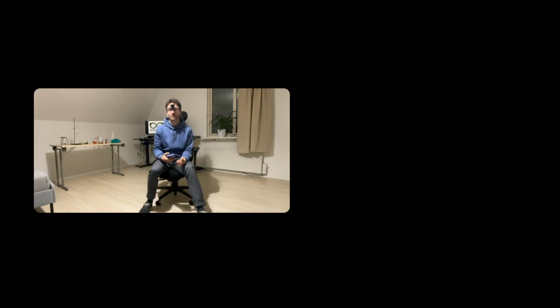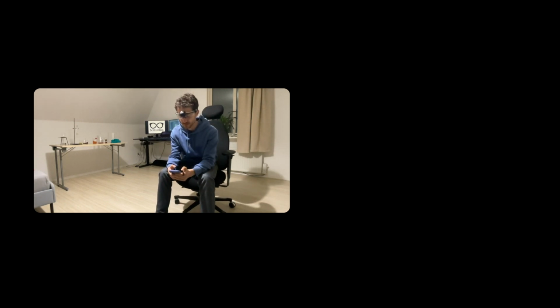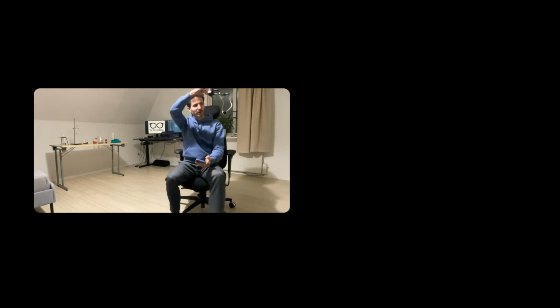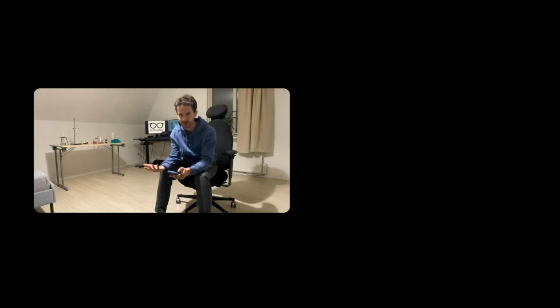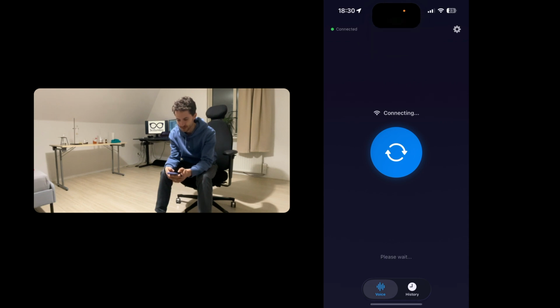Okay, so while the video is being processed online, I can also give you a brief demonstration of the lab companion feature that we have already implemented. But this one is currently implemented in a separate application. It will be implemented into the same application that we are currently working on, that I was recording with, to make it seamless for the user to get the latest information that he needs for the experiments.